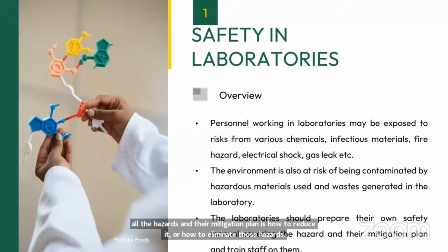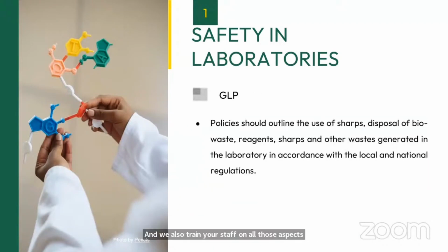Policies should outline the use of sharps, disposal of biowaste, reagents, sharps, and other waste generated in the laboratory in accordance with local and national regulations, whatever guidelines and rules are there.